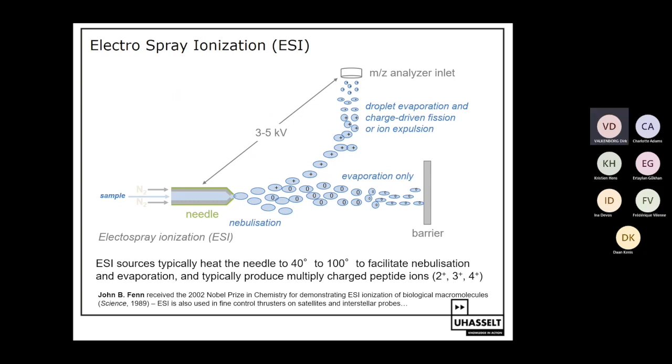In the mass spectrometer, we call this ion optics. Like you manipulate light with lenses, that's how we manipulate ions in mass spectrometry, with electromagnetic lenses, actually. And I will conclude my first session here before I start talking about mass spectrometry.